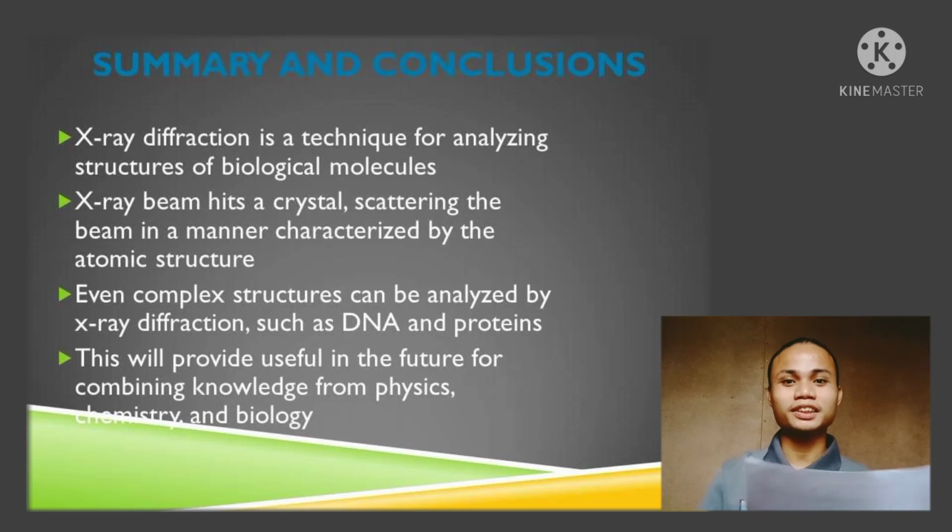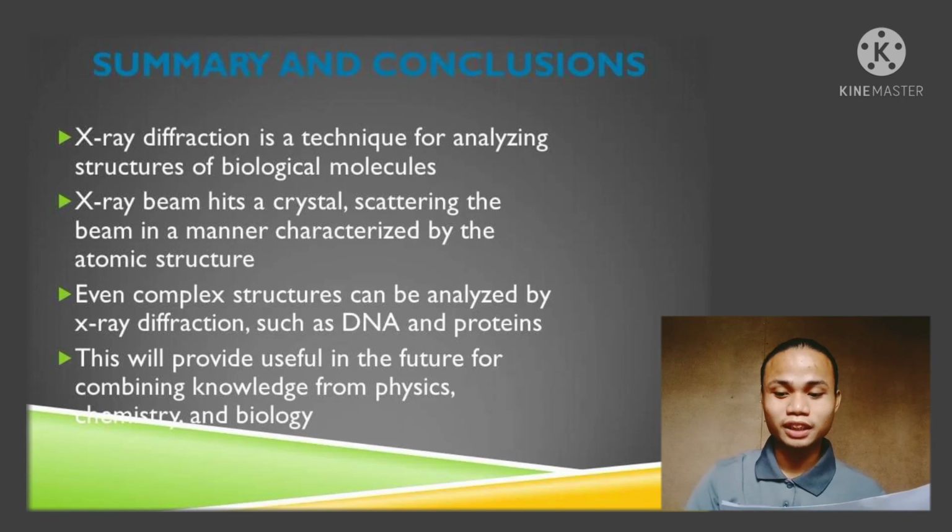Let us summarize it all. Therefore, X-ray diffraction is a technique for analyzing structures of biological molecules. An X-ray beam hits a crystal, scattering the beam in a manner characterized by the atomic structure. Even complex structures can be analyzed by X-ray diffraction, such as DNA and proteins. Thus, it will be useful in the future for combining knowledge from physics, chemistry, and biology.